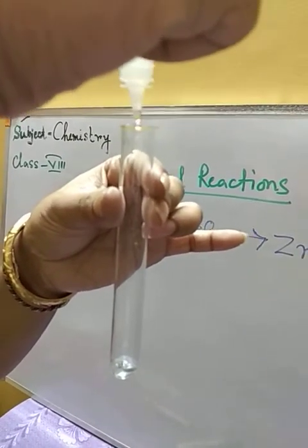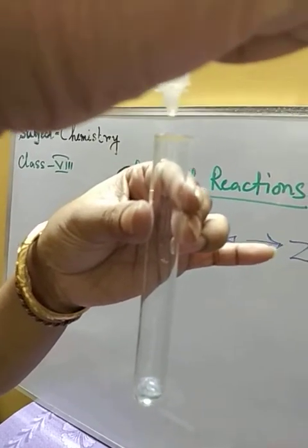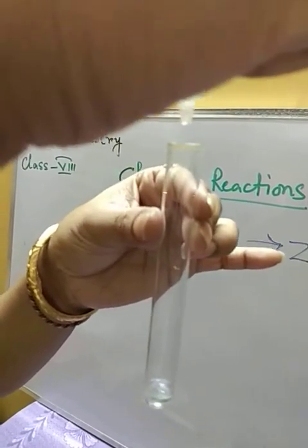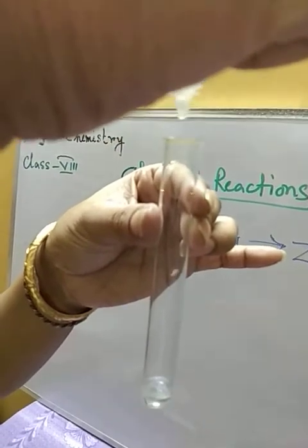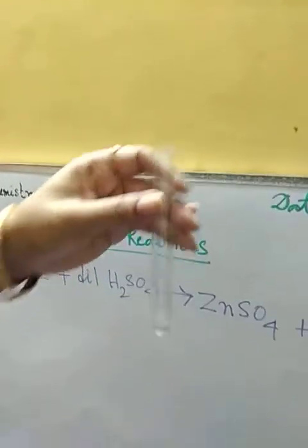Drop wise we are adding. The reaction has been started. Hope you can see that.